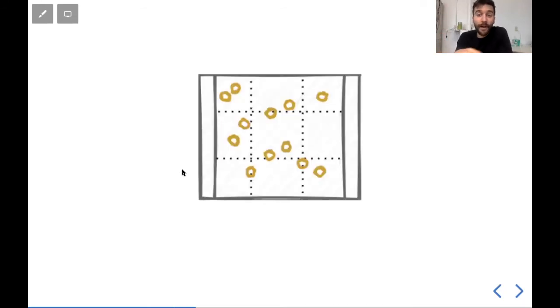And finally, this is a drawn picture of my hemocytometer with little yeast cells on it. There are 9 squares here, but remember, we're only counting a fraction of them. So I only count cells that exist in the outer squares and the middle square. It could be by chance that a lot of the yeast cells end up outside my counting region. That's just by chance. So there's uncertainty there too. And so we want to model all of these sources of uncertainty.